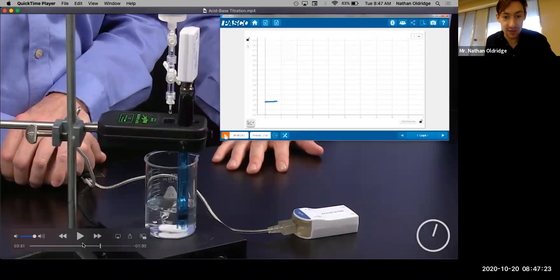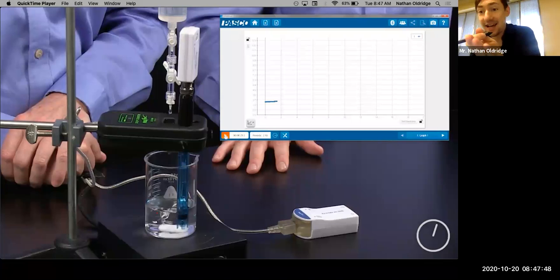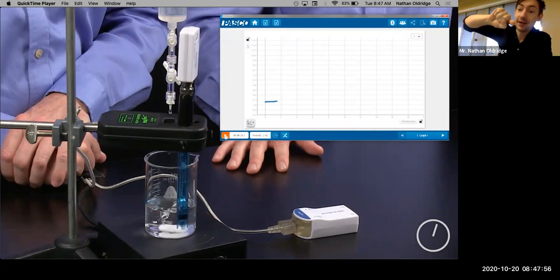Okay, so he's adding drops from the stopcock and burette through his drop counter, which is what's going to cause this data to appear here. I want you to look at the solution. As he adds drops, you're going to start to see pink. Now he is starting with acid and he's adding base. The indicator that he's got in there is clear when it's in acid and then turns pink when it's in base. There's a specific pH where that happens, but we've already seen the equivalence point goes almost vertical. It jumps like 5 pH units in there.